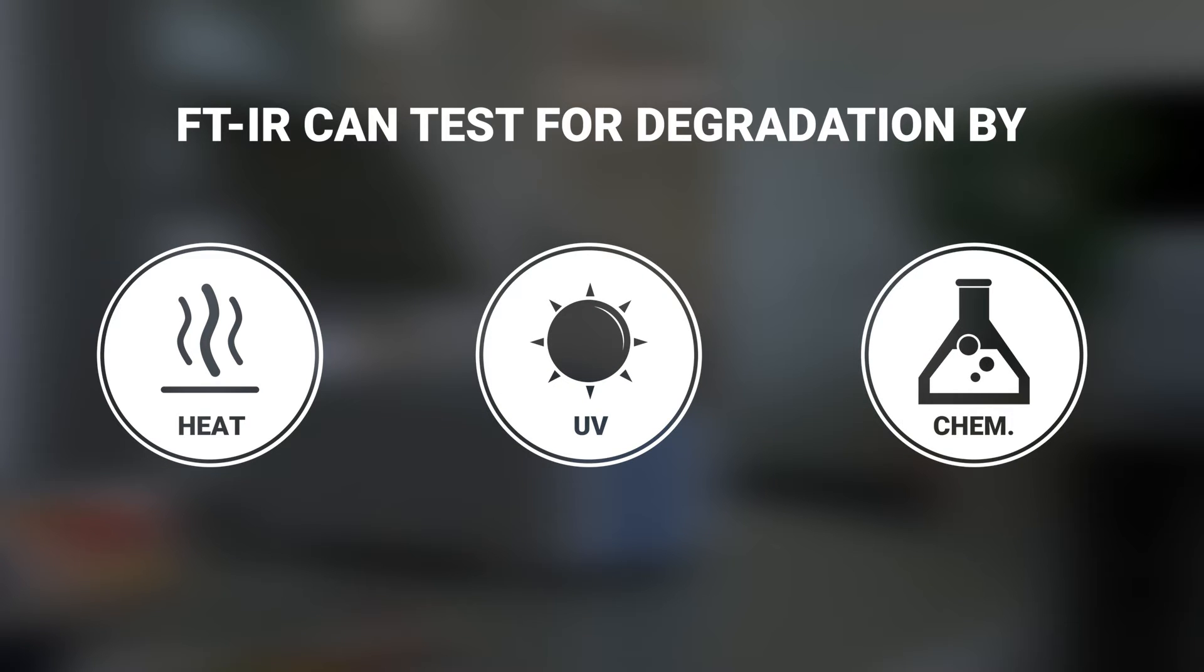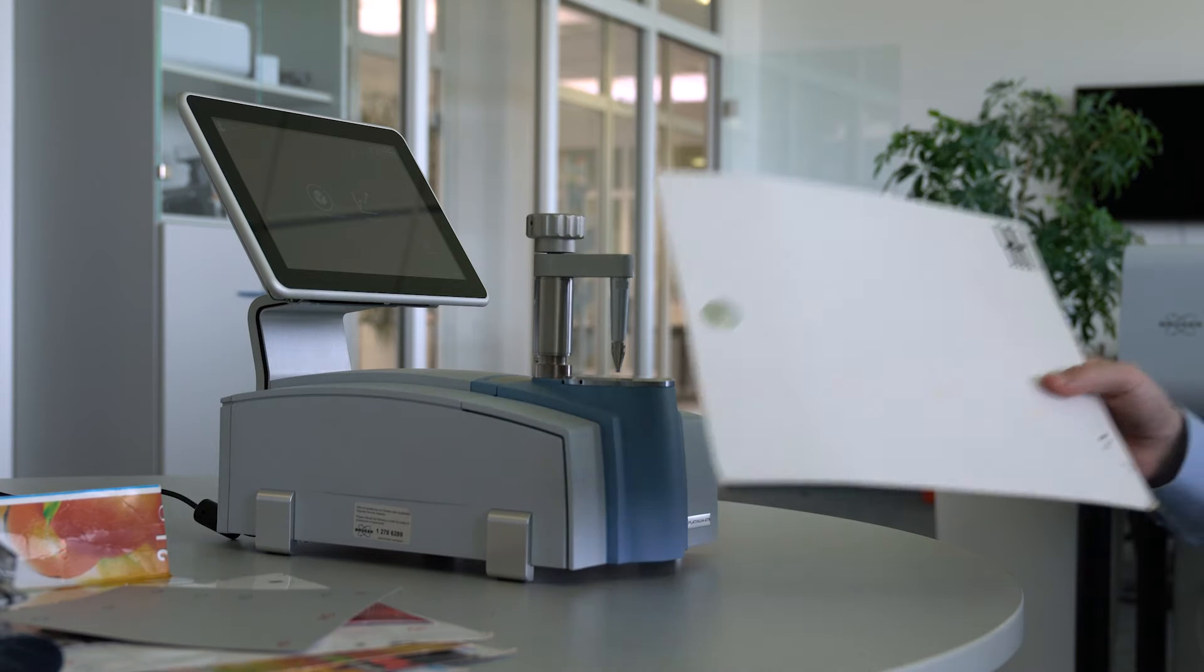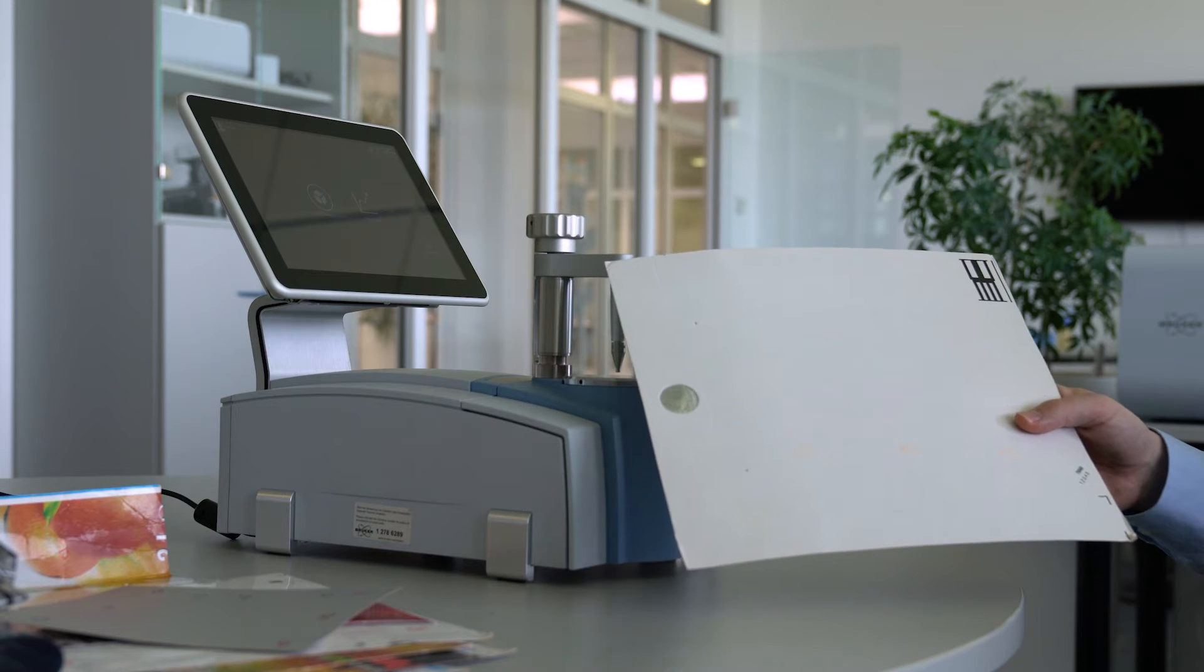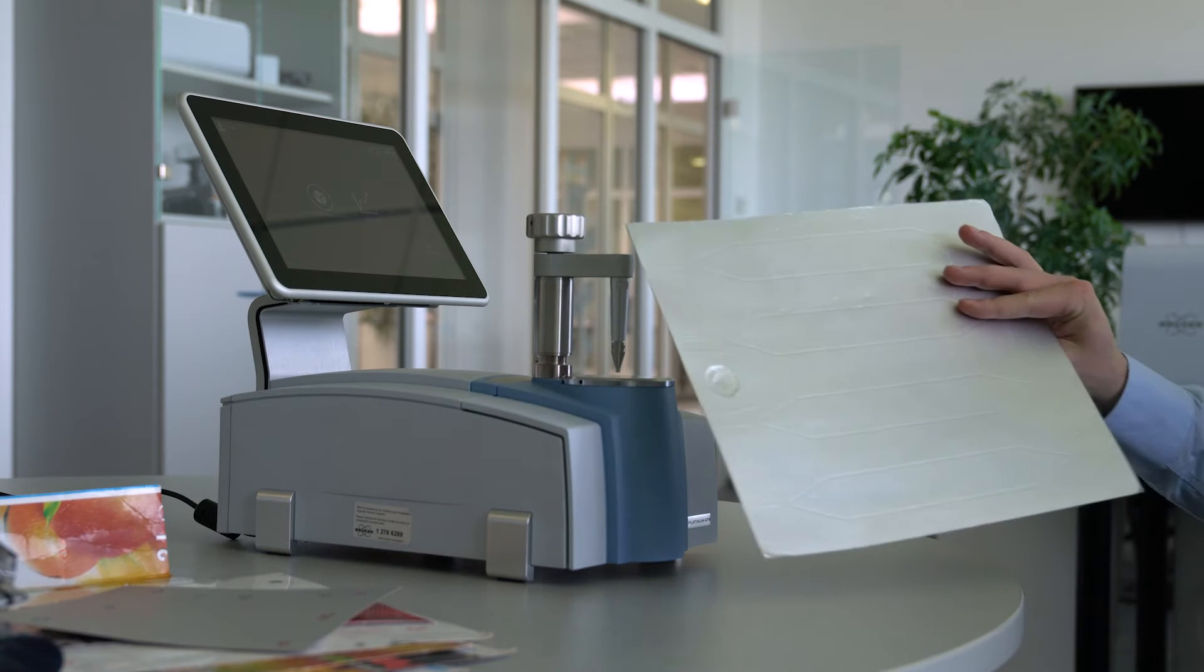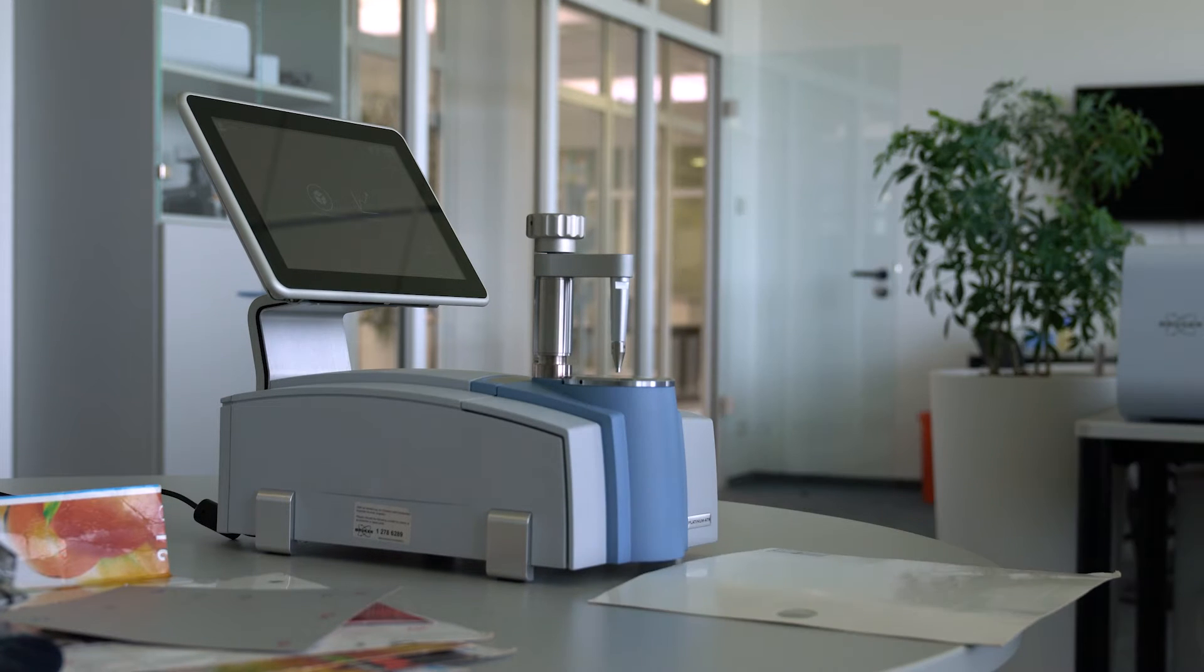In this video, we will check the degree of degradation in a thin layer of polyethylene on the outside of this blank with an alpha-2 FTIR spectrometer.